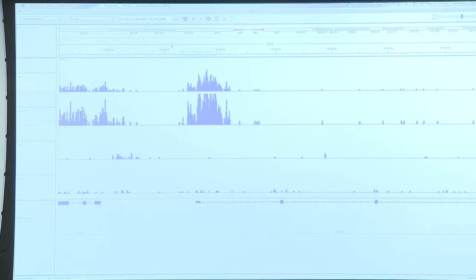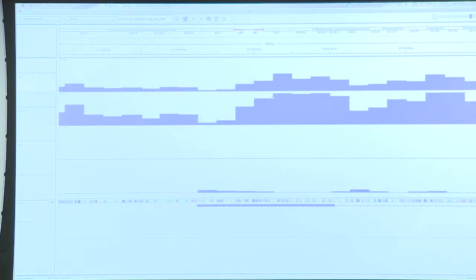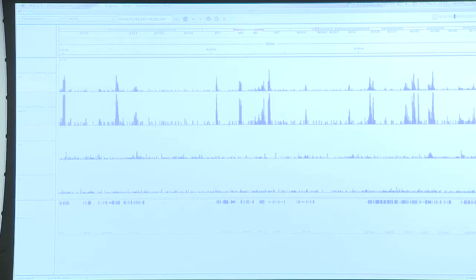We also saw that we can visualize the BAM file, but for instance, the TDF includes some extension of the reads into directions and so on. But I want to demonstrate some of the features of IGV. I just want at least most of you to get to this point.